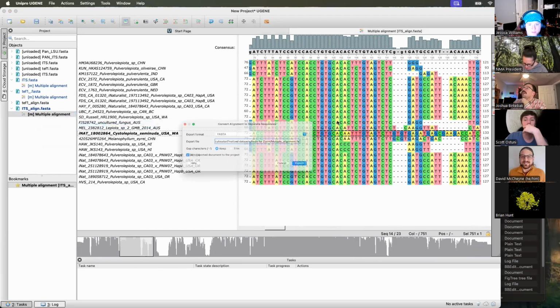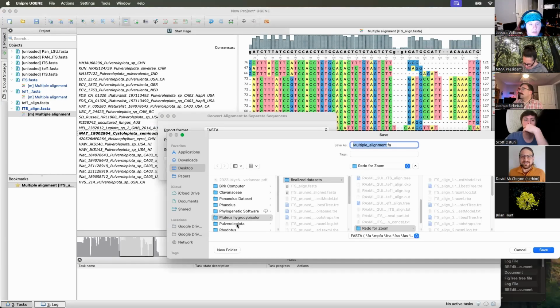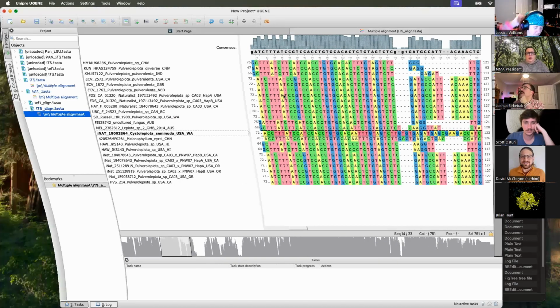Yeah, the haplotype B did have a couple of ambiguities in it, for that one you were looking at. Okay. When I split out the haplotypes, it wasn't very high. It was an 80 reads consensus file, but one of the haplotypes was one of those 60/40 ones. So when I split out one of them, it only had like 20 or 30 reads. So there might definitely be some noise in there. But I think the noise isn't actually going to affect this very much.